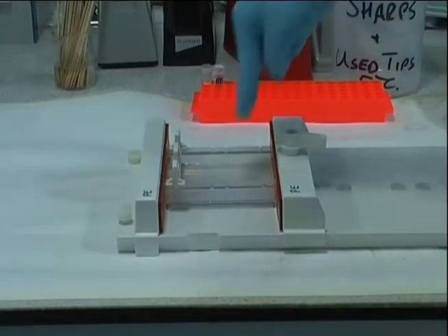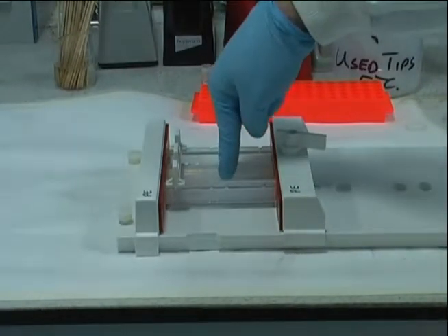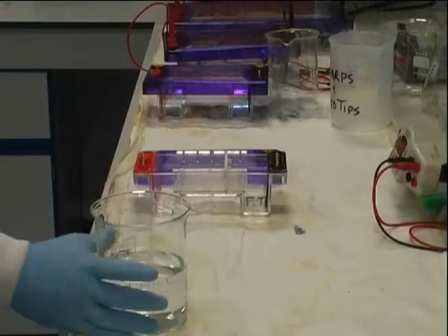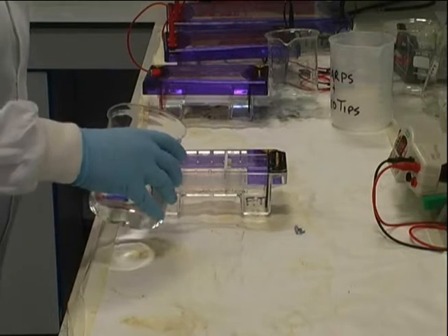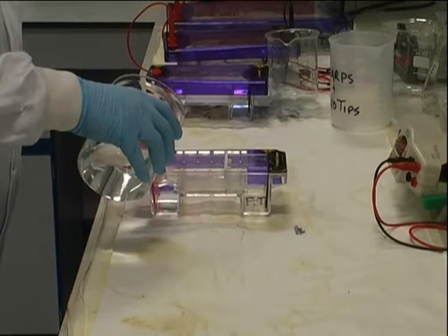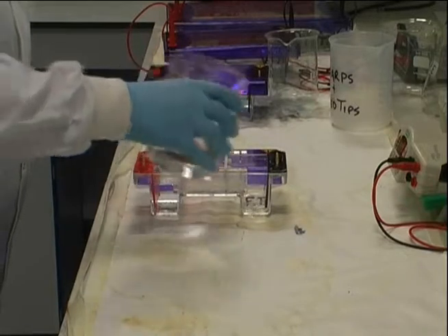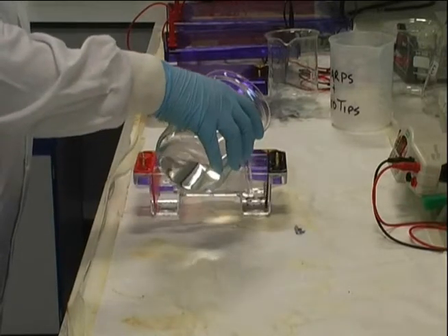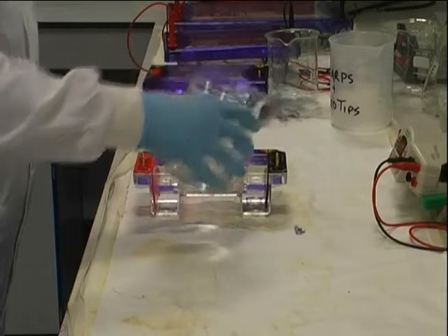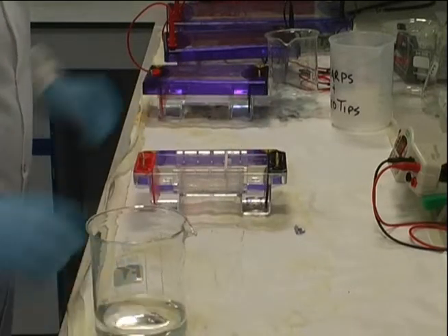After the gel has cooled, a quick check is needed to make sure it is semi-solid. At this point, the set gel is placed in the electrophoresis chamber and immersed in conductive buffer. Then the comb is removed to allow loading of the DNA from the PCR reactions into the newly formed wells.